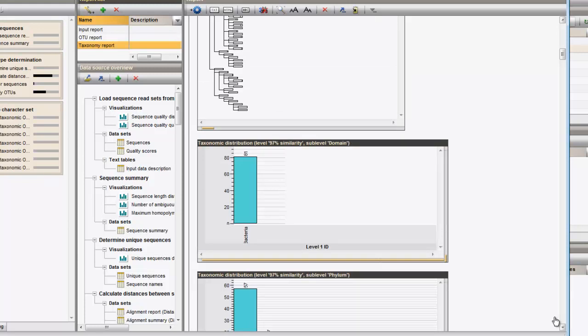Next, the different taxonomic distributions on each of the phylogenetic sublevels are displayed in detail.